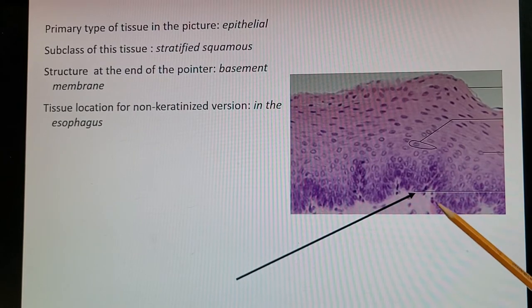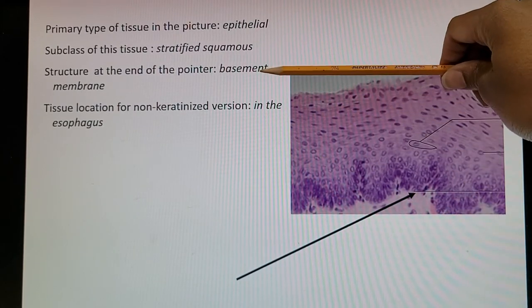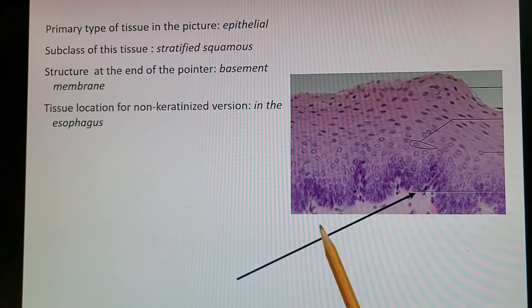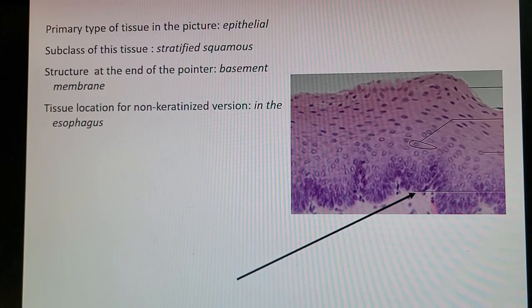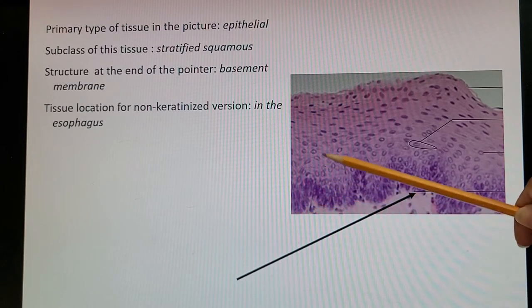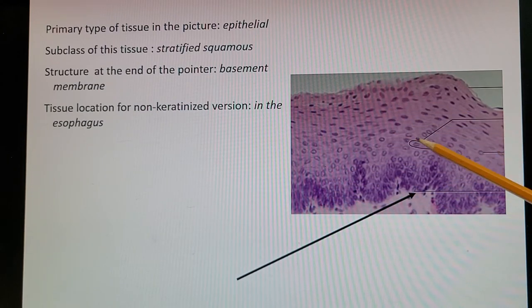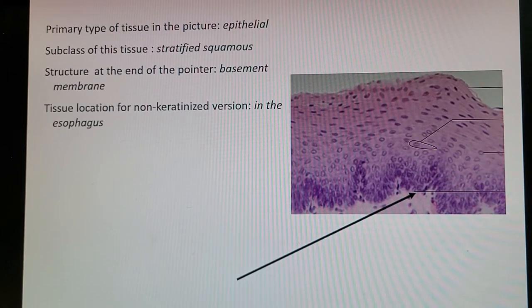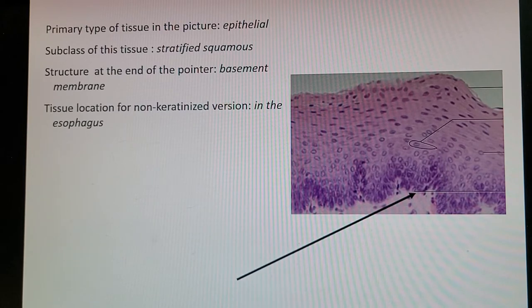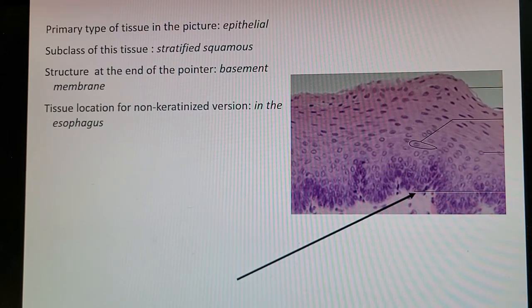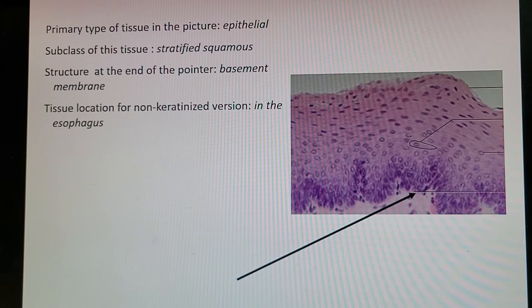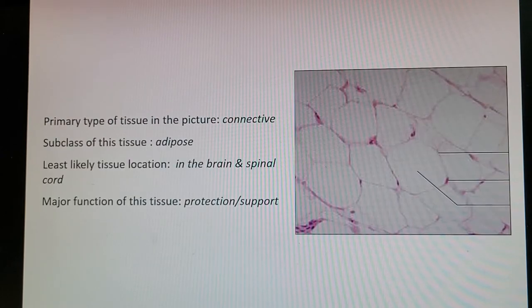Next picture is epithelial tissue. The basement membrane is at the bottom — also the answer for the pointer question. The subclass is stratified squamous: multiple layers (at least two), making it stratified, and the cells have that flat fried-egg shape, making it squamous. For the non-keratinized version — keratinized being skin — this tissue is located in the esophagus. Multiple layers are needed to protect against everything you swallow.